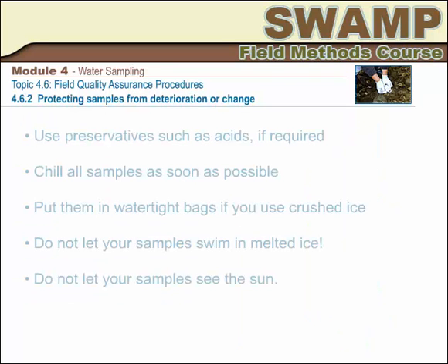If you have used preservatives in the field, while sampling, or by addition of the preservative at the tailgate, your samples only need chilling. If necessary, certain types of samples will be preserved in the laboratory according to protocol for specific analysis, which will be acidification in most cases. Whether preserved or not, properly store and chill samples as soon as possible to prevent deterioration.